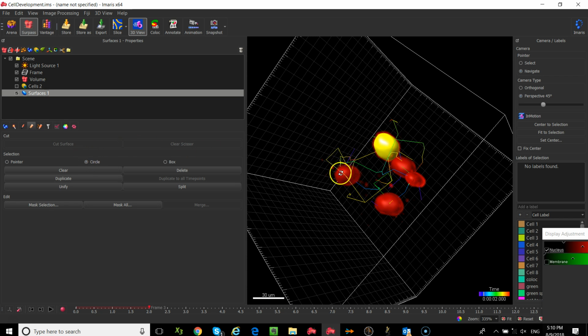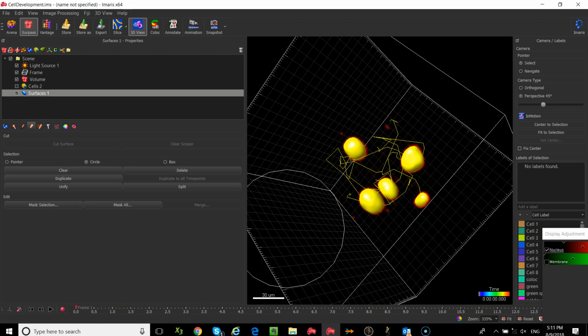It means that instead of having to go in and select multiple options, if you go into select mode, you can make a little sphere or circle and select all of the objects within that region. So it's a multi-selection tool. But ultimately now I've selected everything at one time and all the way through the experiment.